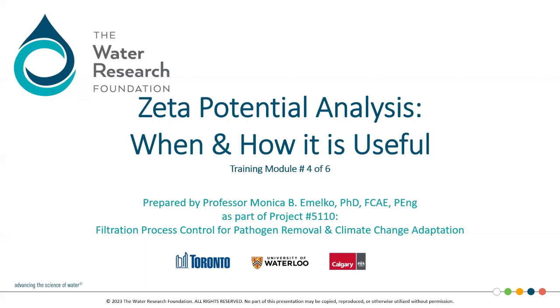Hello, and welcome to Zeta Potential Analysis, when and how it is useful. This is training module 4 of 6 that were prepared as part of Water Research Foundation Project 5110, Filtration Process Control for Pathogen Removal and Climate Change Adaptation.